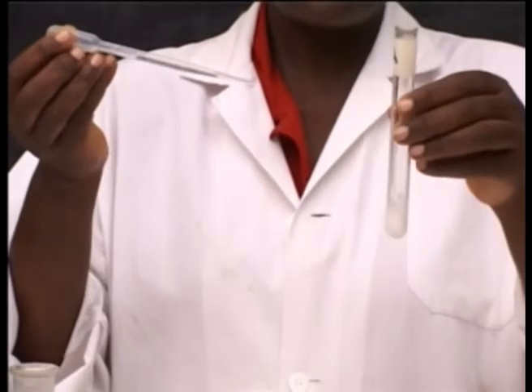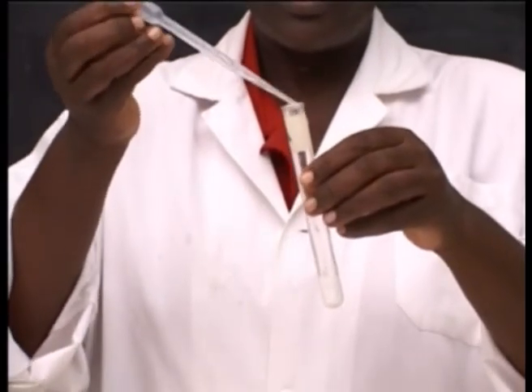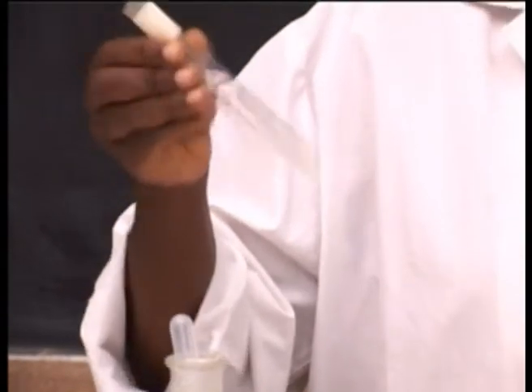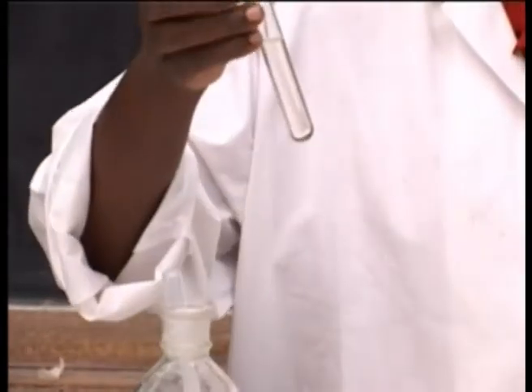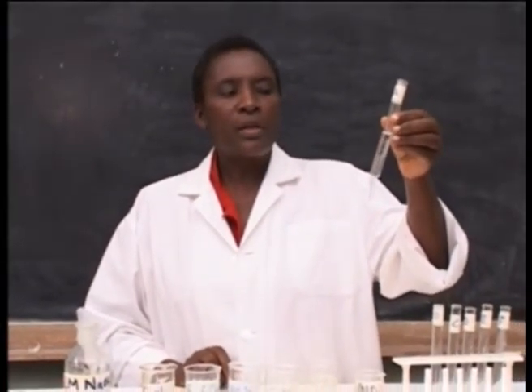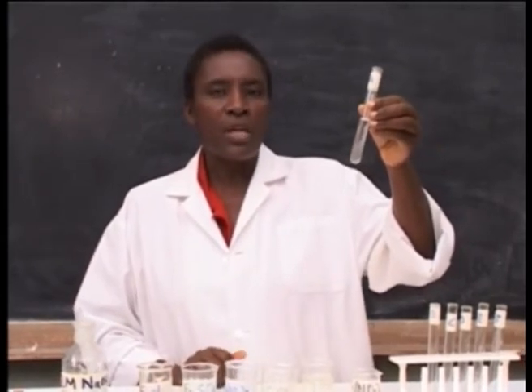Then observe the changes. In excess of sodium hydroxide, the salt which formed is soluble in excess of sodium hydroxide.